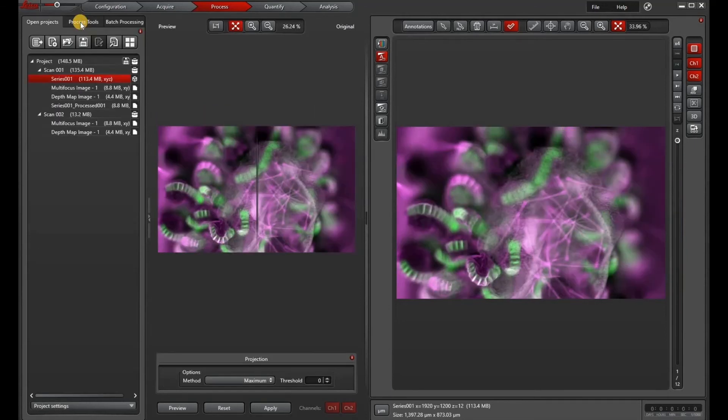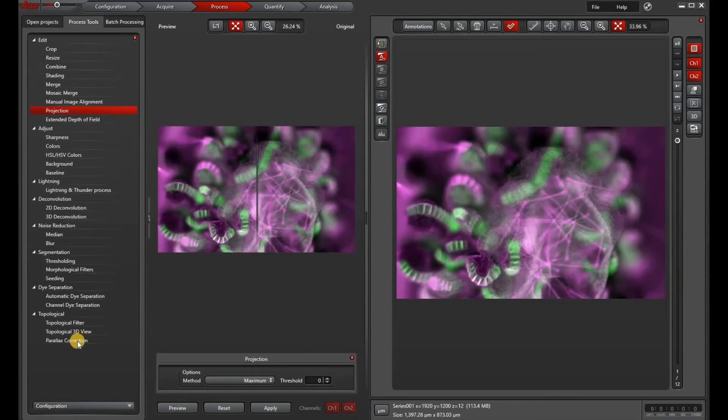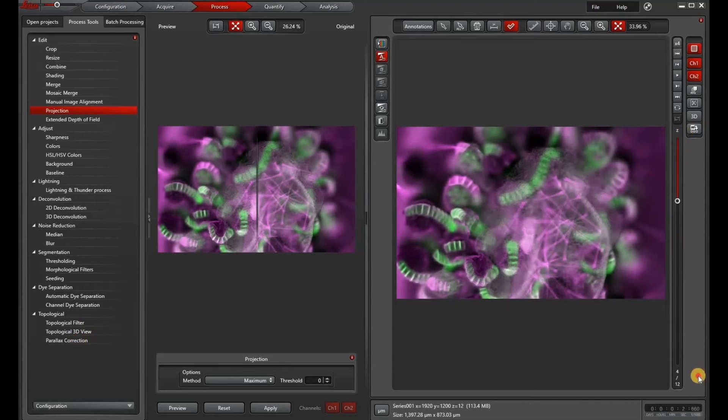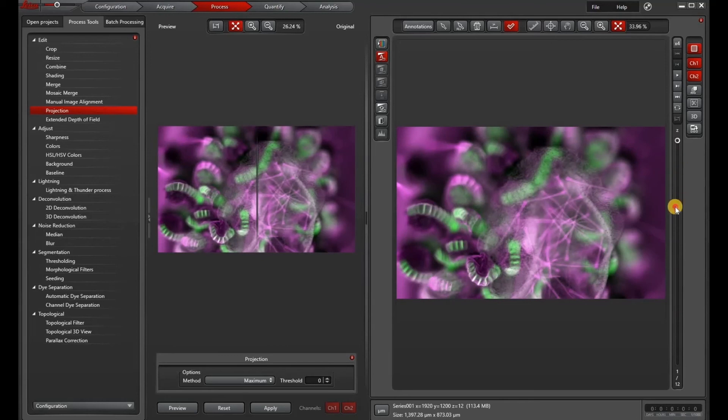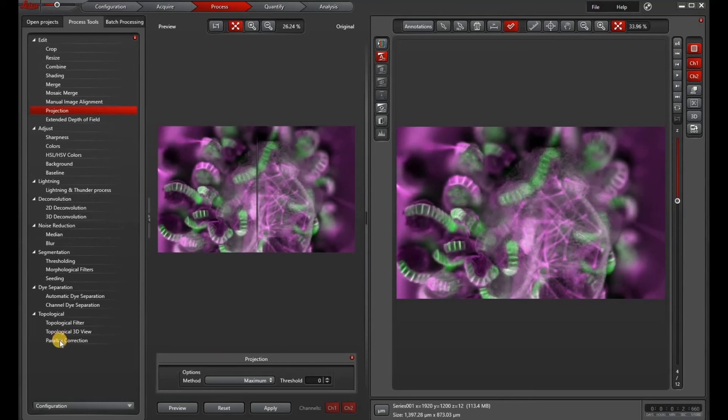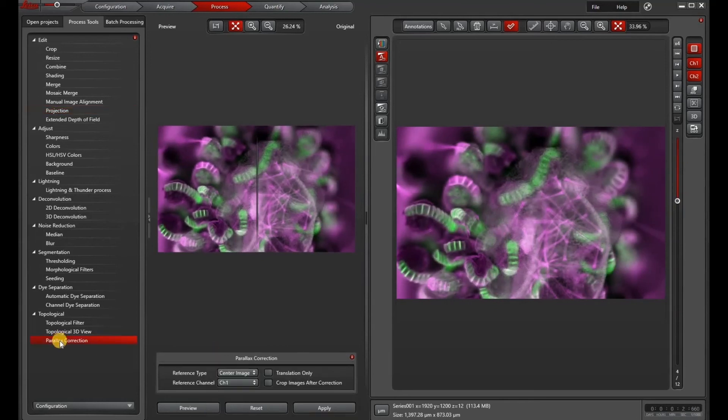The other kind of projection is a maximum intensity projection, but before we do that, we have to do an alignment called parallax correction. You can see that as I scroll through the z-stack, the image shifts a little bit. That's because of the stereo optics of the microscope.